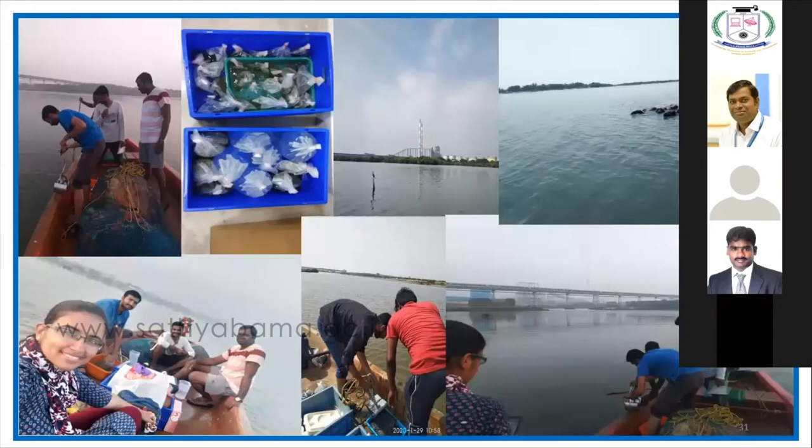I will show one small experiment in my lab. This is the place called Ennur Estuaries. We have collected different samples from here with the help of a grab sampler and a core collector to collect the mud samples, which will be sieved through a 0.5 mm screen. The animals retained in it will be carefully removed and preserved in 5 to 7% formalin. For molecular study, the sample will also be stored at 4 degrees Celsius in 95% ethanol. The polychaetes will be identified by standard books and field guides, electronic keys, and articles published by scientists.